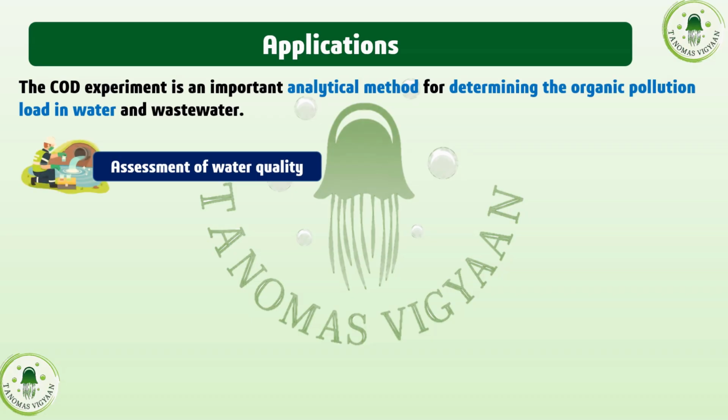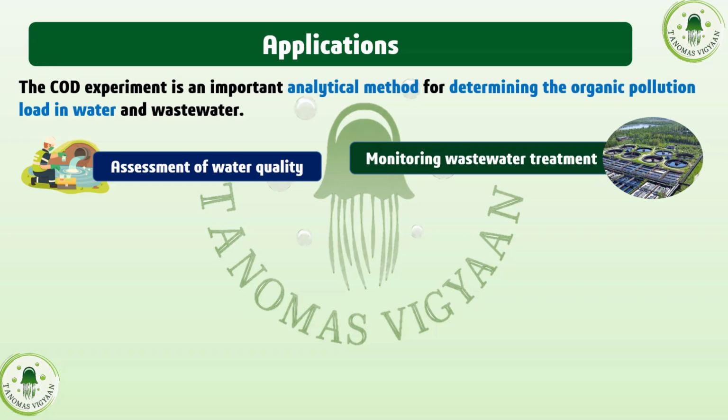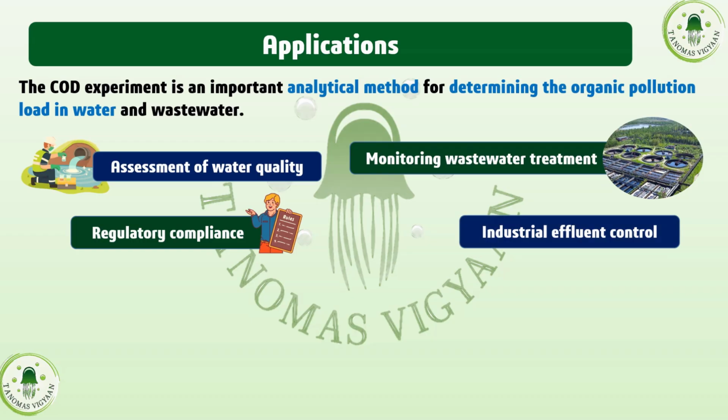Assessment of the water quality, COD experiment is required. For monitoring wastewater treatment, okay, COD is very helpful. For regulatory compliance also, you have to take the standard regulatory limits which are given by the government in order to do the COD. And then industrial effluent control, you can do it.